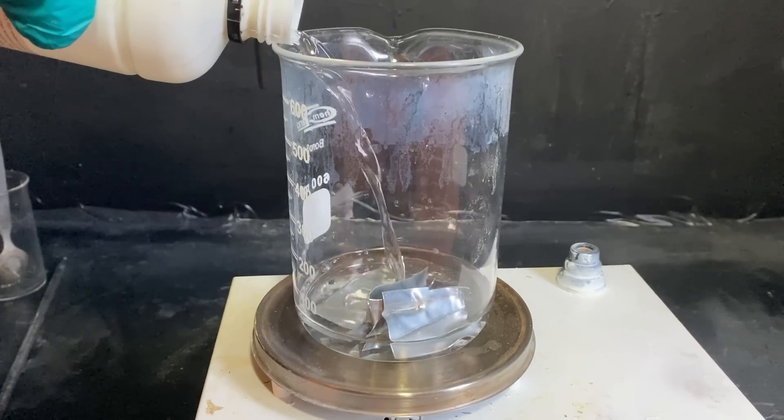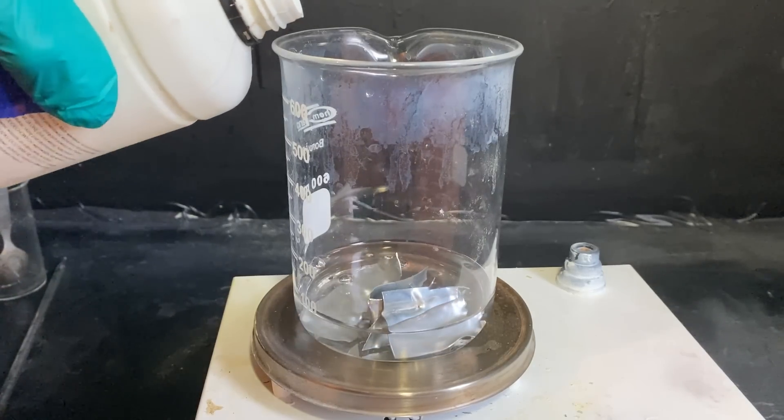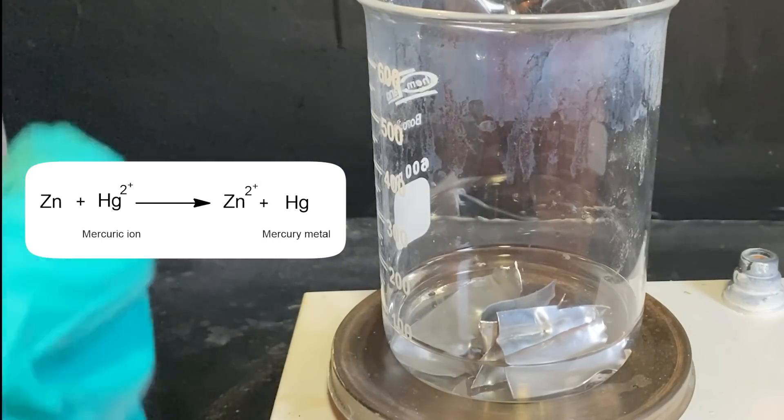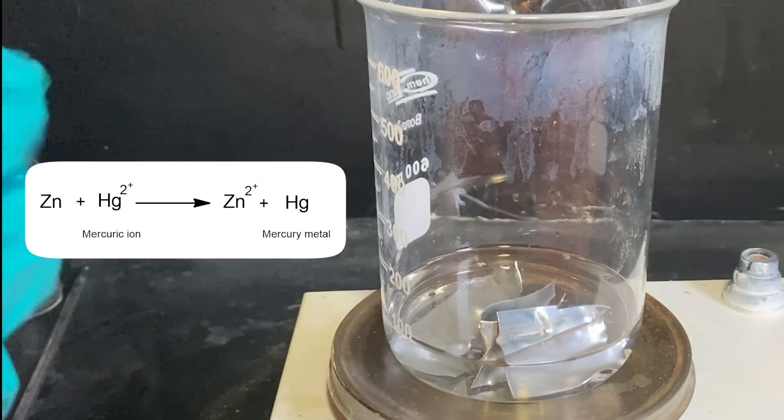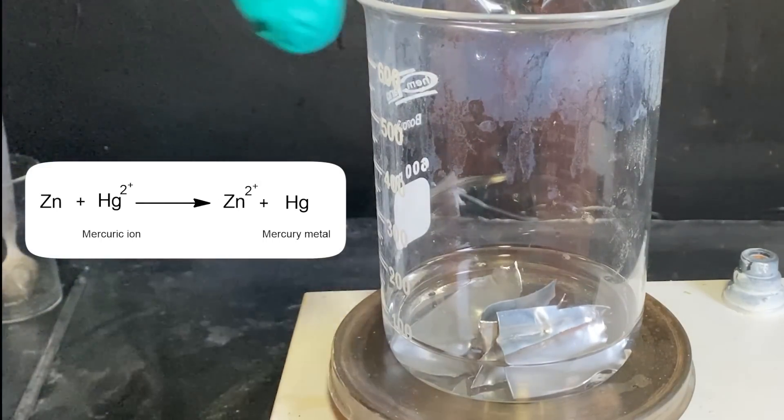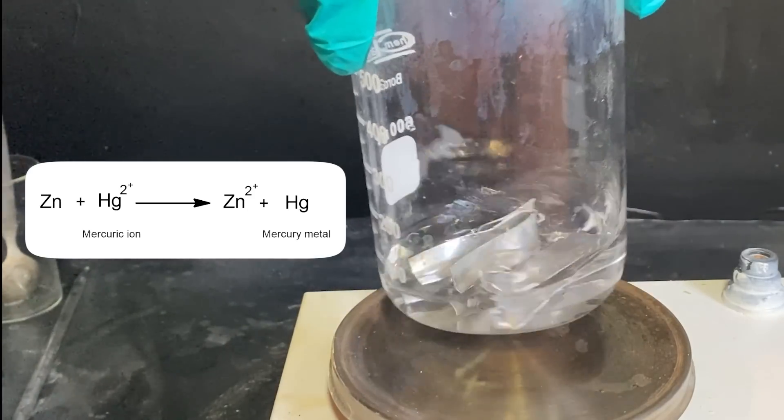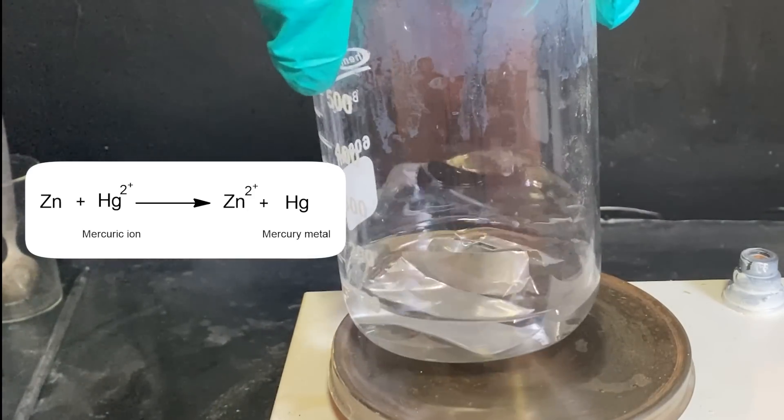What's happening here is that mercury is getting liberated from the solution by the zinc. Zinc is more reactive than mercury, so it takes mercury's place in the solution. Meanwhile however, the exact opposite is happening, and the mercury deposits on the surface of the zinc. The mercury on the surface of the zinc forms an amalgam.